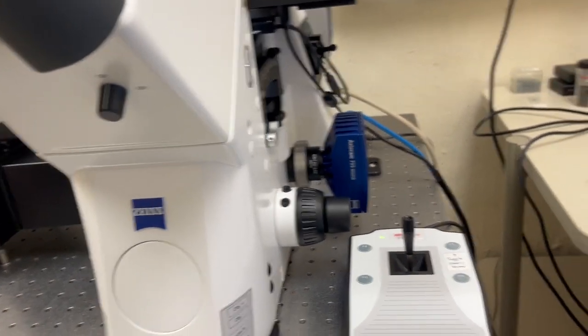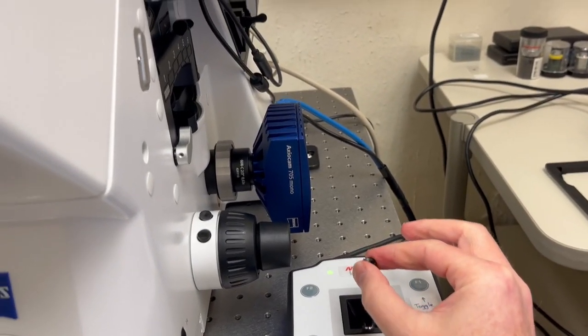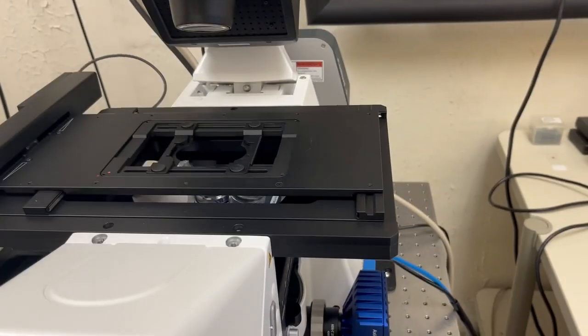That's it for the focus knob — let's discuss the joystick. This system has a motorized stage, so to move the sample you will manipulate it with this joystick. As you move the joystick you'll see that the stage moves.